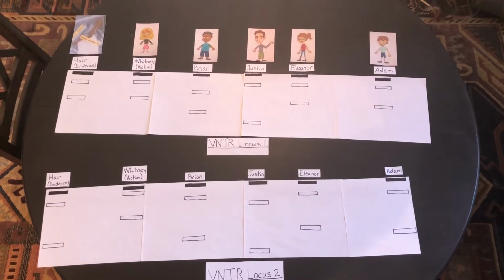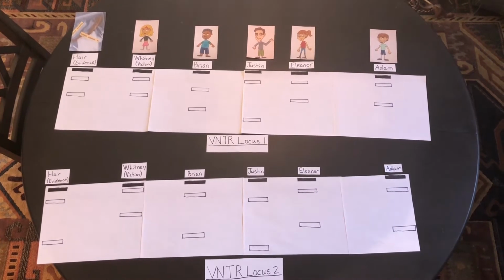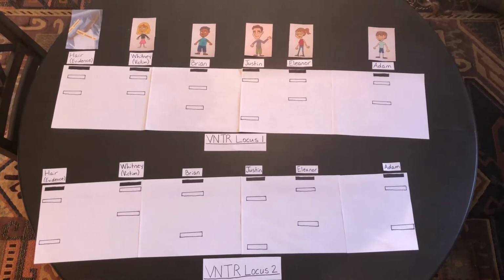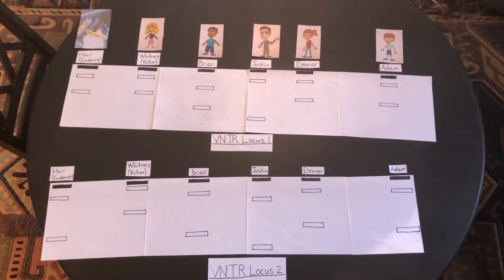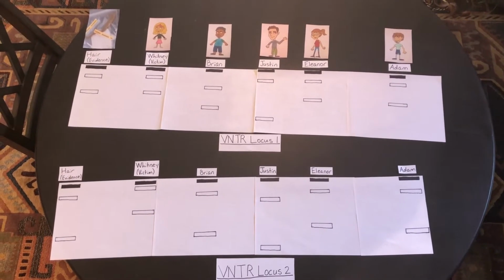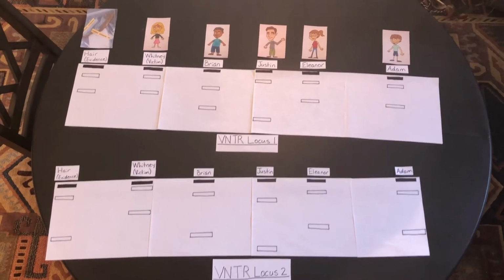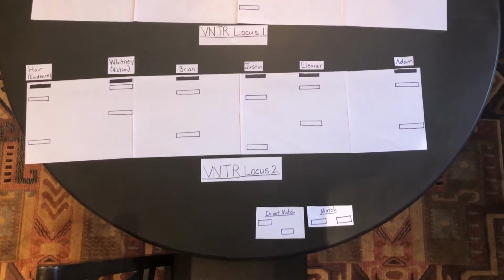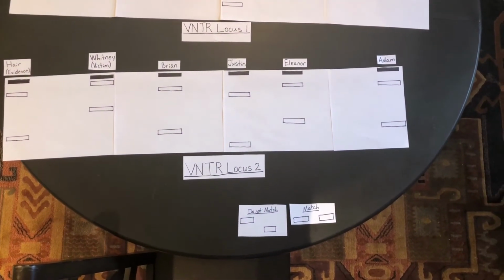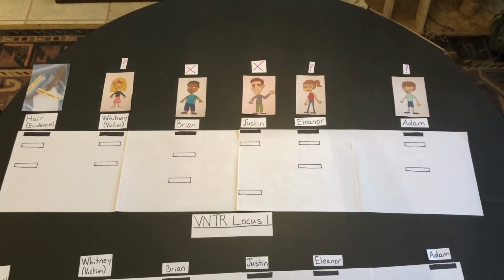Here we can see 2 alleles found at different loci for the evidence, the victim, and the 4 suspects. After analysis of the DNA fingerprints, we can determine which one of the suspects could be the culprit of Whitney's murder, though not necessarily meaning he or she is the culprit. The DNA analysis is done by figuring out which suspect matches all alleles and loci of the found hairpiece. If a suspect does not match all alleles for any given locus, then they can be excluded from leaving the DNA evidence.